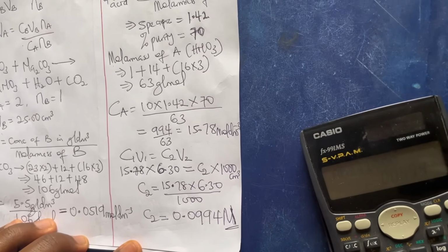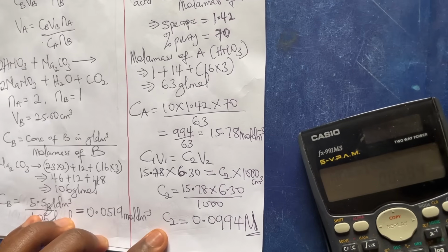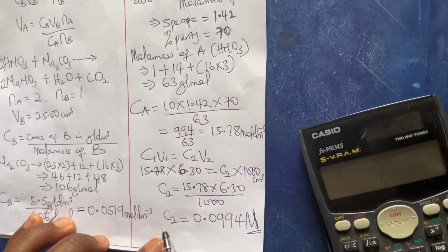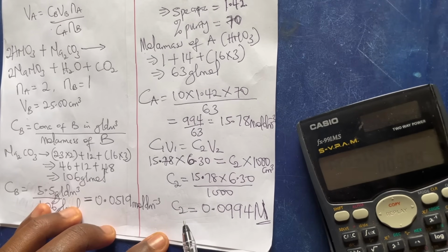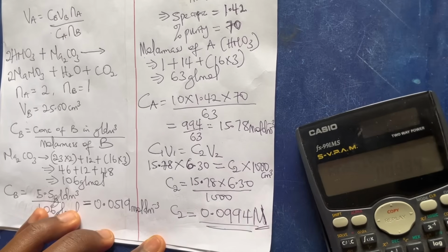Molarity, or you call it mole per dm cube. So this is the concentration of the diluted acid in mole per dm cube. So that's it. This is the value I now need.